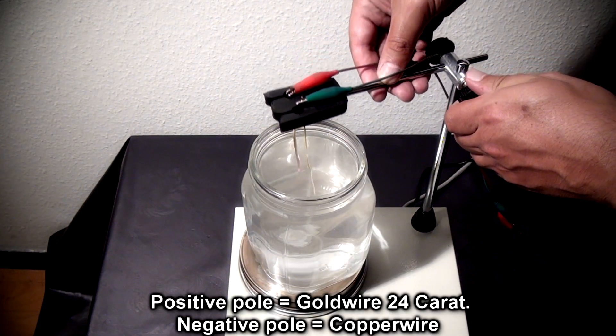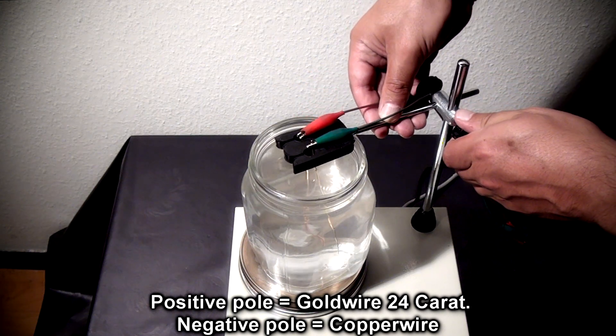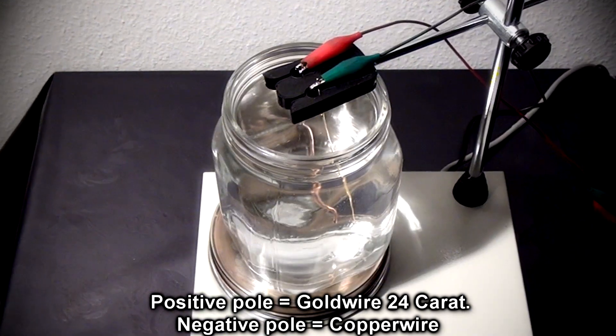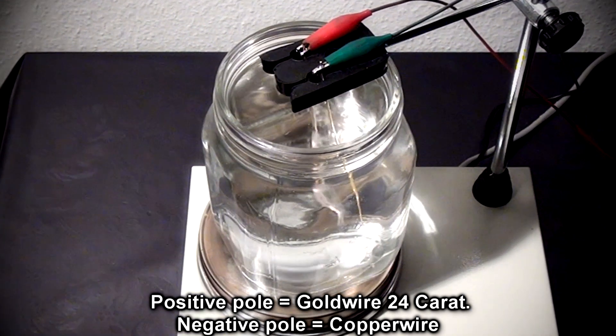On the negative pole is a 12 centimeter long and 2 millimeter thick copper wire. On the positive pole is a 12 centimeter long and 1 millimeter thick 24 karat gold wire.